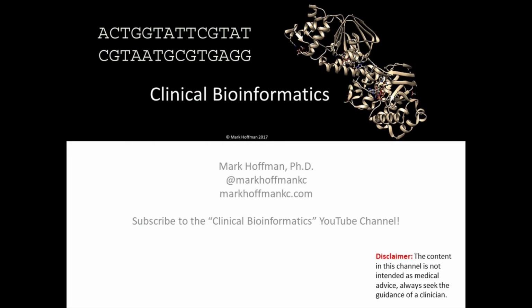In this session, we've seen some basics about using a bioinformatics application to predict the secondary structure of proteins based entirely on the protein sequence.